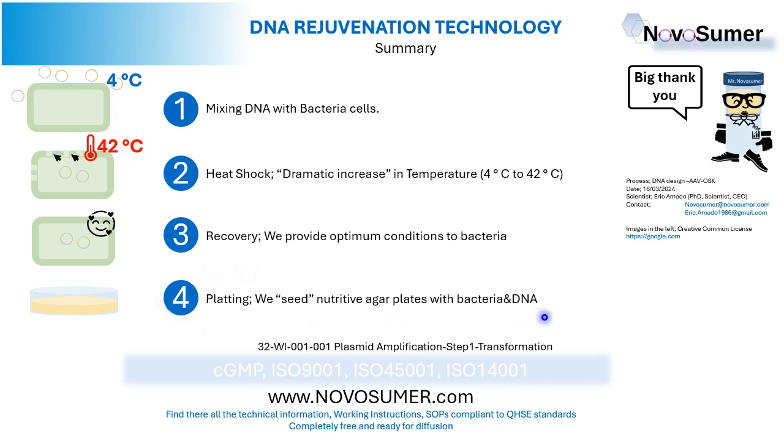Easy? It is easy. Well, I have to say that this information is well detailed in the form of exhaustive protocols. These protocols have all the information, providers, material, full description, because you have to understand that this is just a presentation.